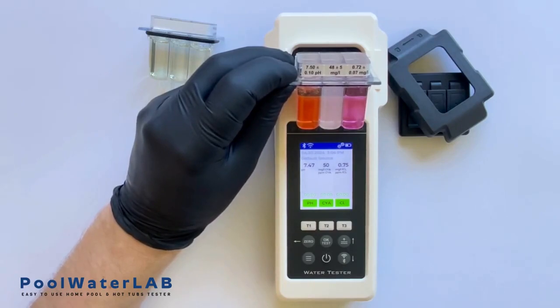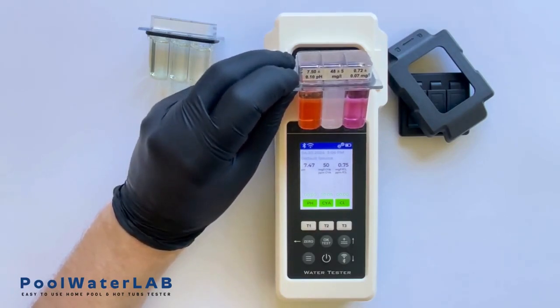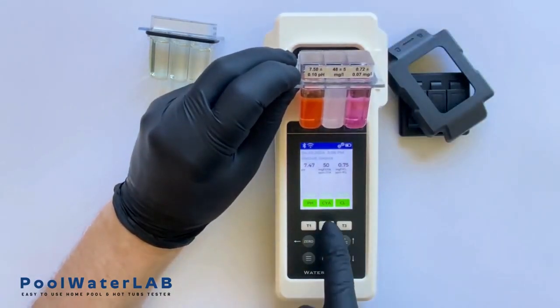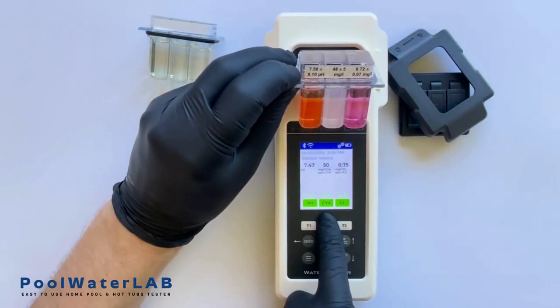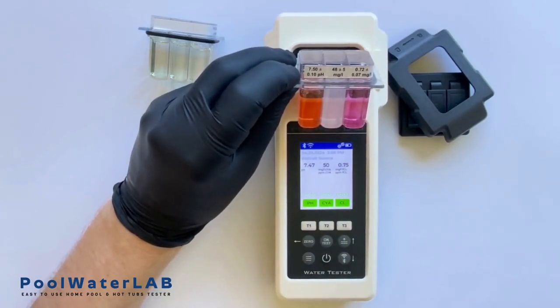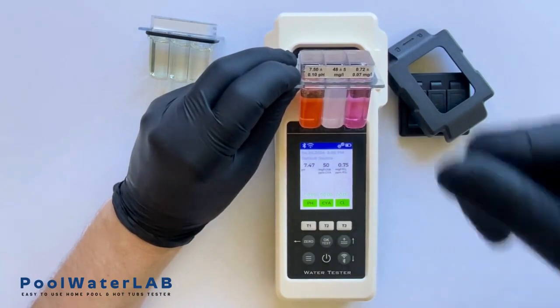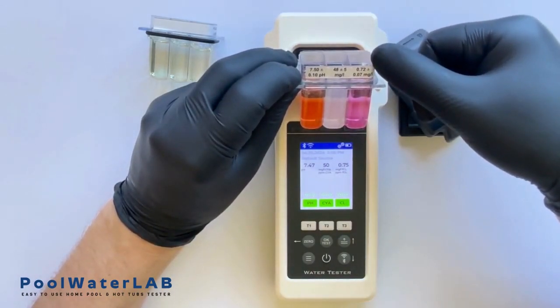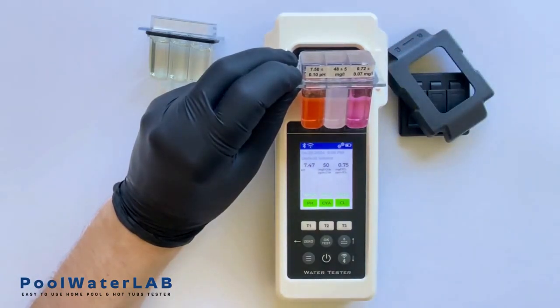The next parameter is cyanuric acid. The laboratory sample shows a value of 48, while the tester result is 50. The next parameter is free chlorine. The laboratory sample indicates a value of 0.72, and the tester shows a result of 0.75.